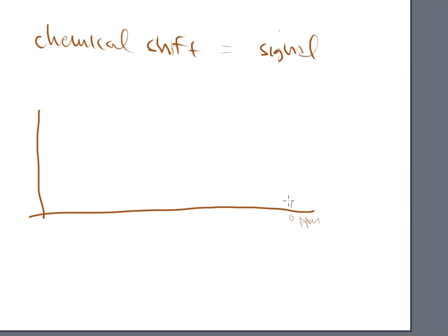That's where my TMS is going to be. And let's say that we have a signal. It looks almost like a mass spectrum in a way. So we just see a line that shows up. And this particular line, we don't call it a line, we call it a chemical shift. So that is in regards to the signal. So just some proper terminology that we use in the world of NMR.